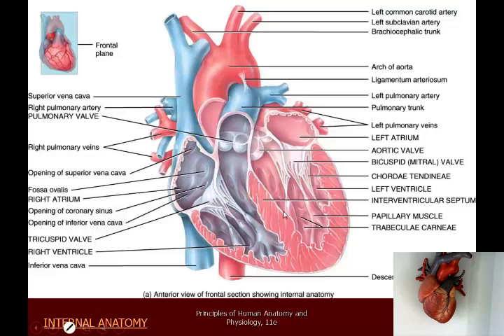But in any case, it's good. So that way, if we do a coronal section, it's going to give us a view that is similar to what we see in the book and like you see here in the PowerPoint. Okay. Now these vessels, like the pulmonary trunk, etc., are on the very anterior surface of the heart. So oftentimes when you're doing this coronal section, you may be deep to these, so you might not get a good view of the pulmonary valve, but you should get a good view through the left side of the heart with the left atrium, left ventricle, and even the aortic valve.